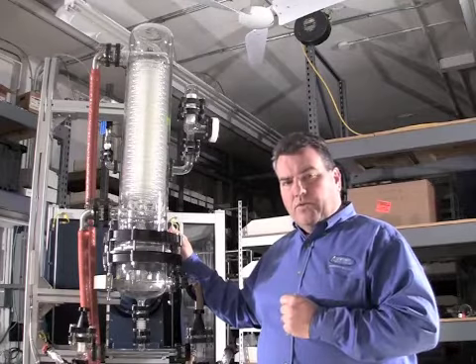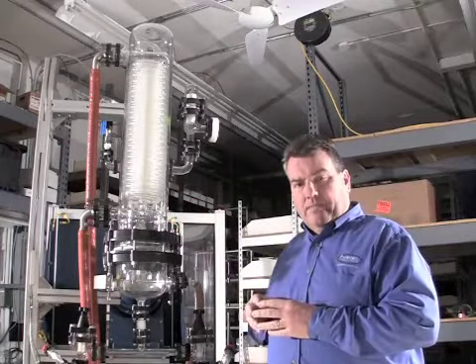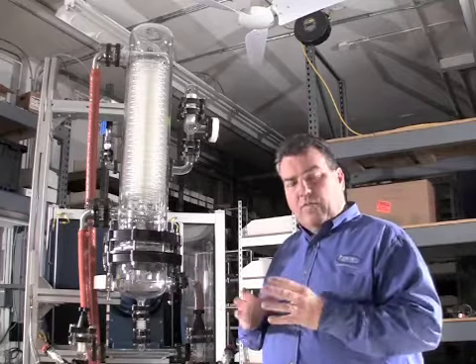Let's look a little closer at the Strike 5000. The first thing you notice is it's made of all borosilicate glass. All wetted parts are either borosilicate or Teflon, so it's completely corrosion resistant and offers high purity.